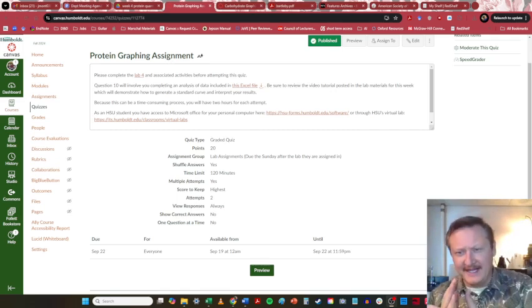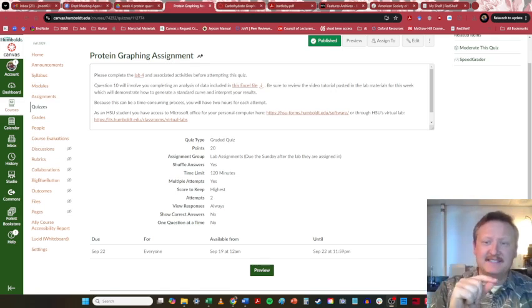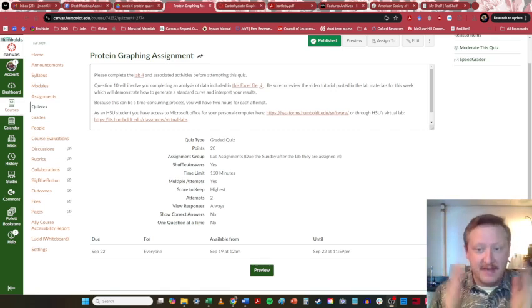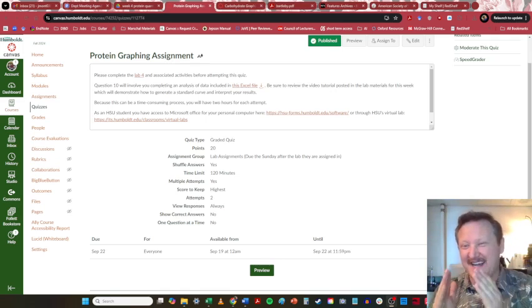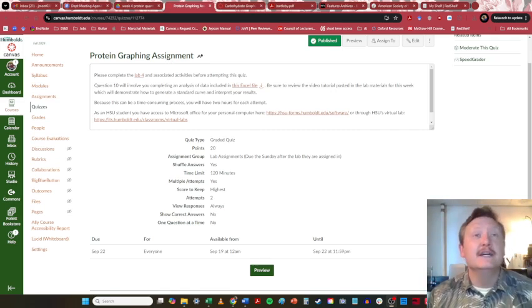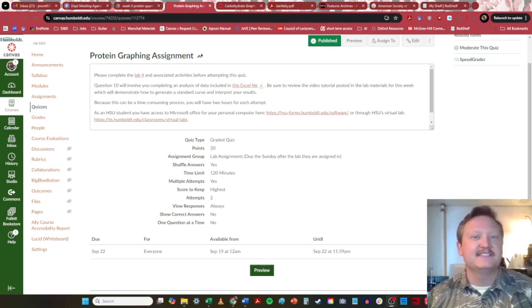Here, we're going to be analyzing data for Biology 105 involving the protein assay, looking at the effectiveness of different buffers for lysing E. coli cells. So the metric we're using for assessing effectiveness of those buffers is how much protein gets freed up when we expose the E. coli to the different buffers. All right, let's go ahead and just get started.